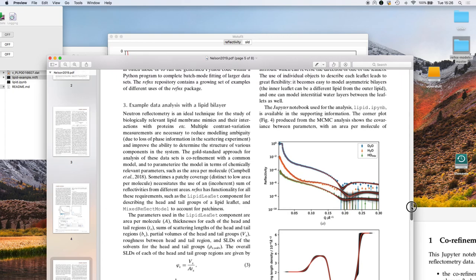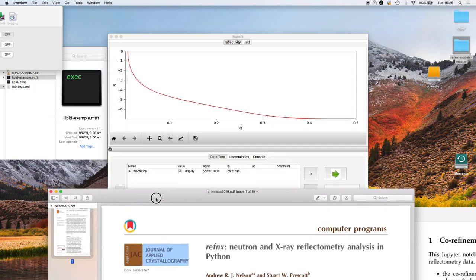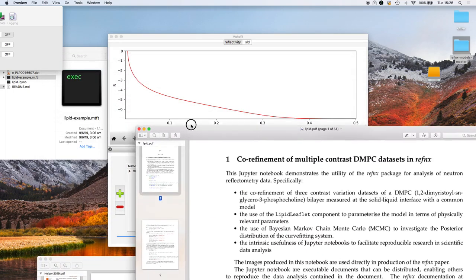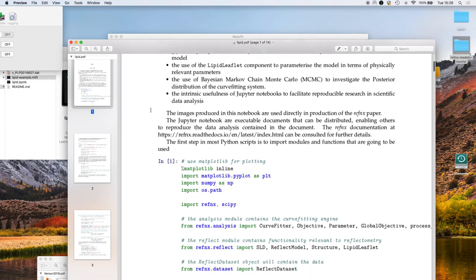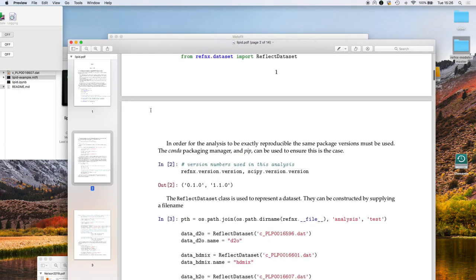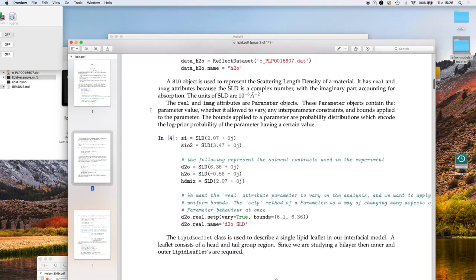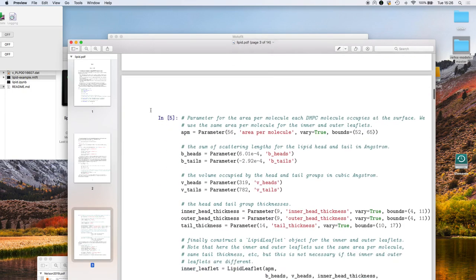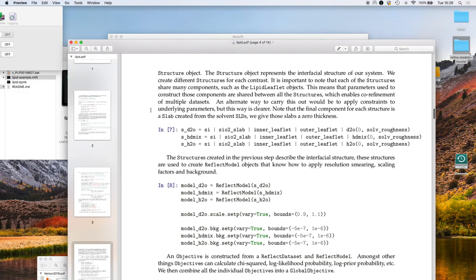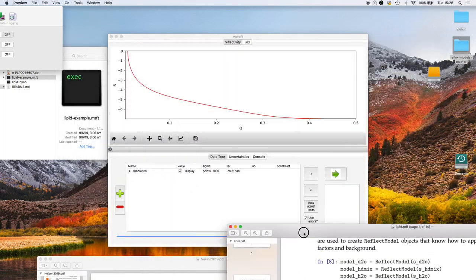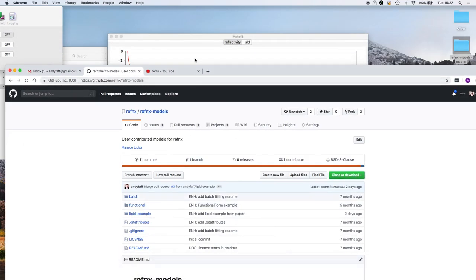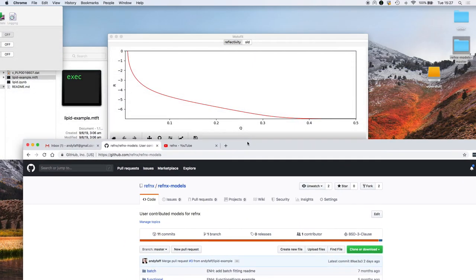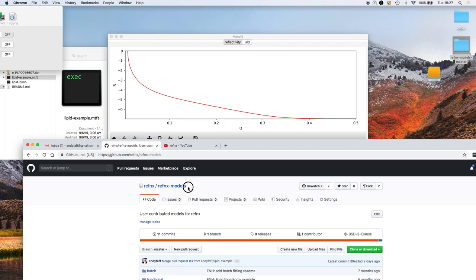The paper itself is in the Journal of Applied Crystallography and in the paper supporting information there is a Jupiter notebook that is executable from a Jupiter notebook server. You can reproduce the analysis we're going to do yourself from that Jupiter notebook, but we're going to actually do it in the GUI today. The information we're going to use is held in the Refnex models git repository which is on GitHub.